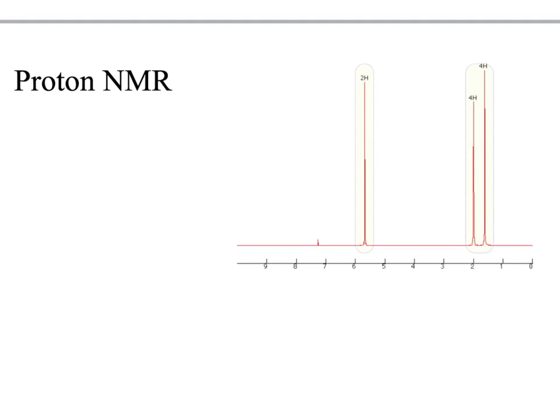After looking at MS and IR spectrometry, we came up with the formula C6H10 with a DOU of 2, indicating the presence of a pi bond and a ring, with a possible double bond between carbon and carbon with sp2 hybridization, and then carbon hydrogen bonds with sp3 hybridization.